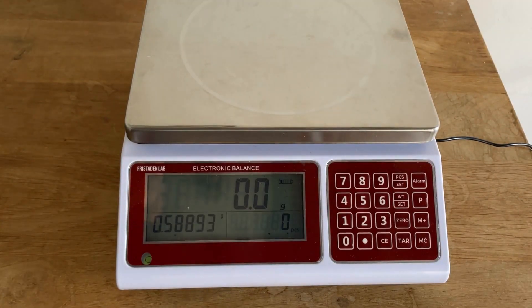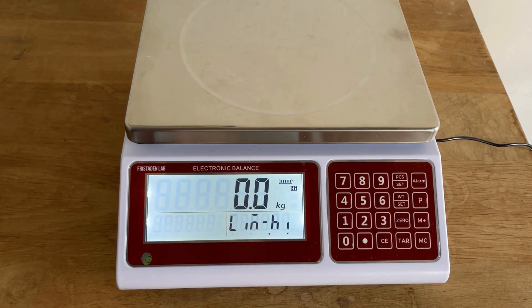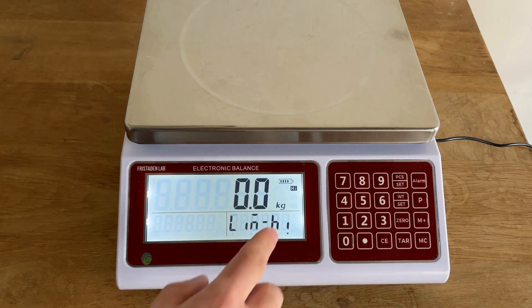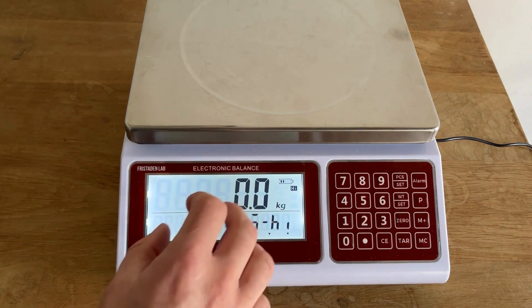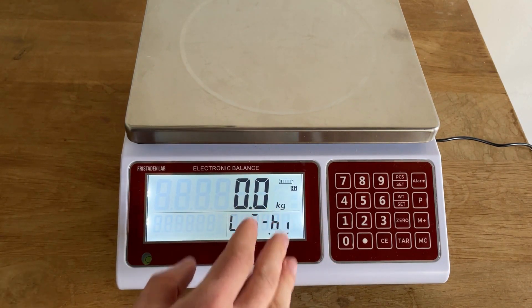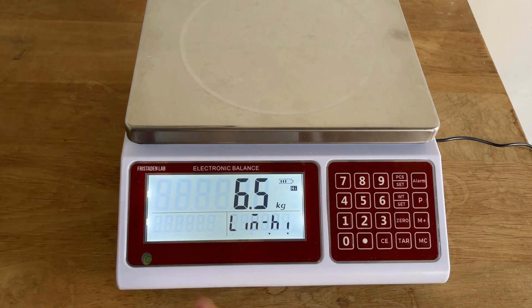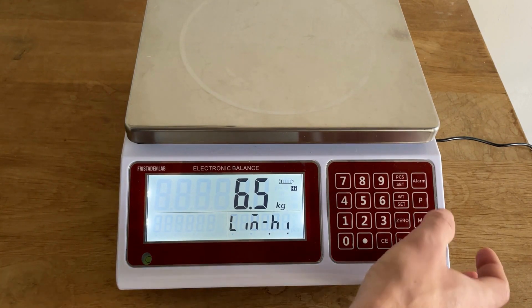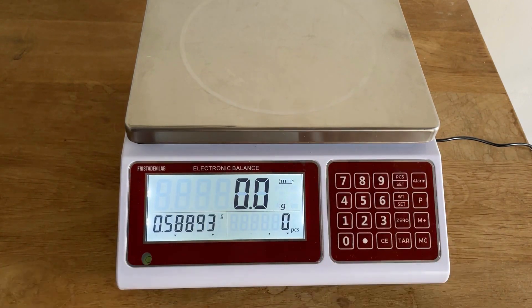The check weighing function is used in inventory management to verify that a unit has the correct weight or piece count. Press the alarm button and enter the upper bound weight first. Note that the display says kilogram for each unit even if you were previously in grams — this is an error in the electronics on the scale; it actually uses whatever unit you had selected. Enter 6.5 as the upper bound and press alarm.